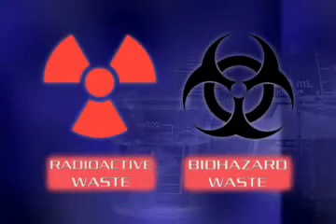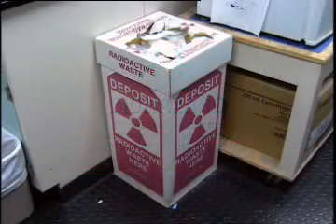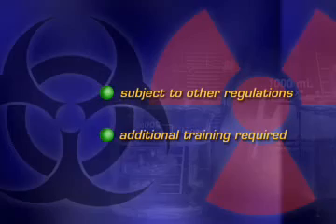Note that radioactive and biological wastes are not included in the mentioned hazardous waste classes. These wastes must be handled according to different regulations. If your lab generates any of these types of wastes, consult your environmental specialist.